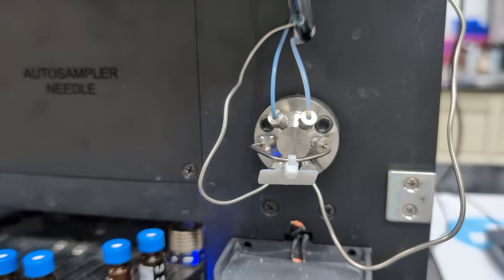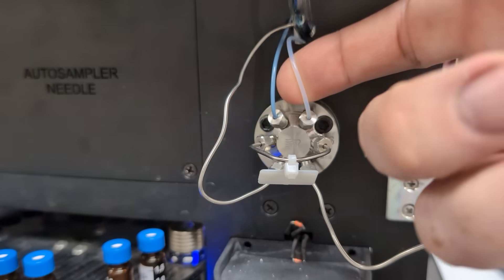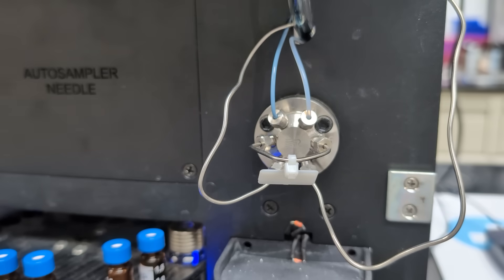You'll hear that valve turn a couple of times. It'll turn to inject, wait about two minutes, and then switch back, and allow you to start cleaning the sample loop, the needle, and the sampling syringe portion, all while the run is happening. That way you don't lose any time in between your runs.